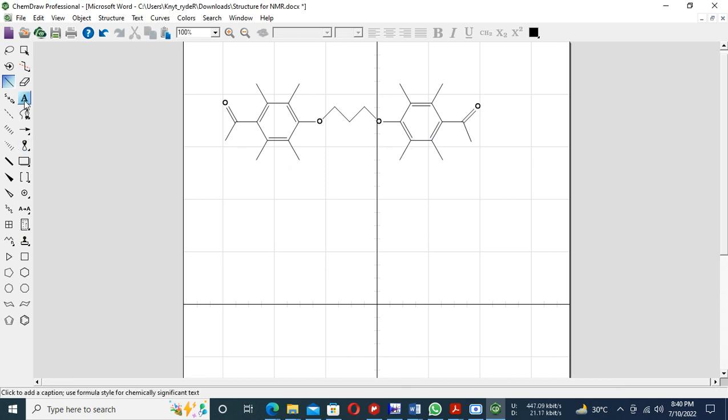Okay, so we have a proton here, we have protons here, we have protons here. Let me finish first and then I'll address your queries.